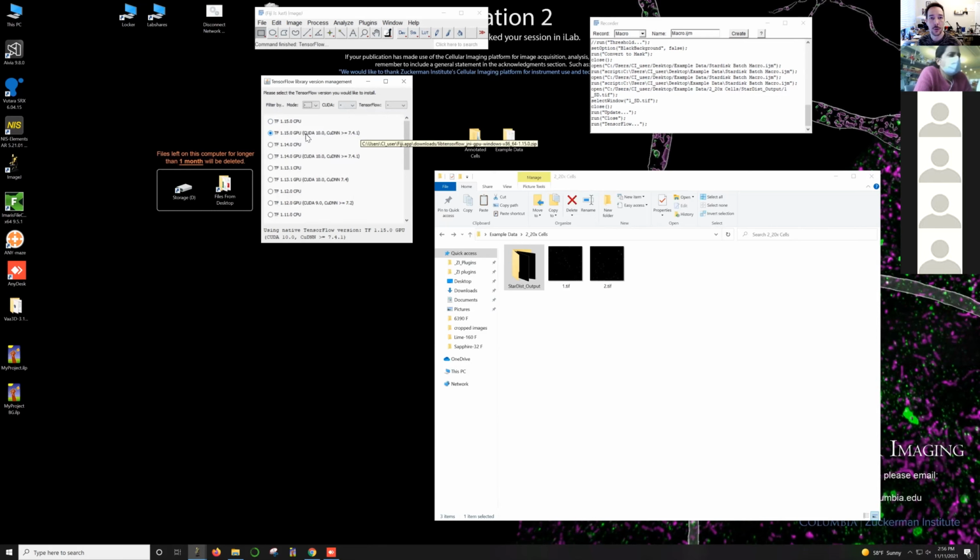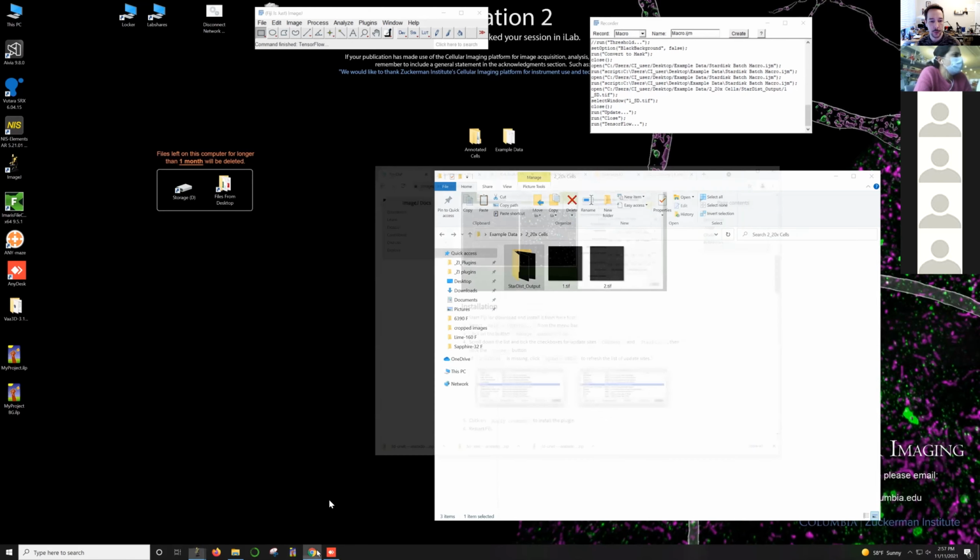The other thing you'll need to do is make sure that you have the right software installed so that you can use this properly. This will install the TensorFlow version, and it's telling you here what you need to also be installed. These are the tools to use the NVIDIA card, specifically so that you can do these neural network training and predictions. And it's telling you exactly what versions. I think one of the main barriers for people is they know they need these things, but they just go and download and install them, and invariably you'll end up with mismatched versions, and it just won't be using the GPU properly. So just pay attention here and make sure that you are installing the correct versions for what you're trying to do.